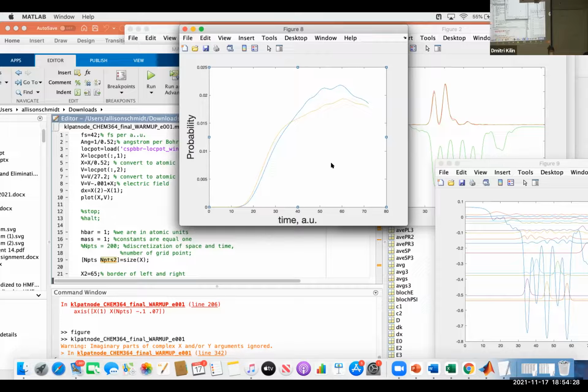You will have an effect of the electric field controlling electron transfer. So please do not fear creating too many data points. If you rerun it 20 times and put 20 figures analogous to this one into PowerPoint or Microsoft Word, it will be your data which we will analyze later towards your report.